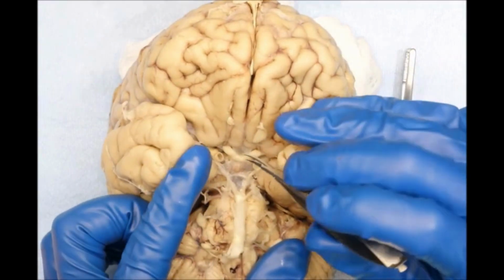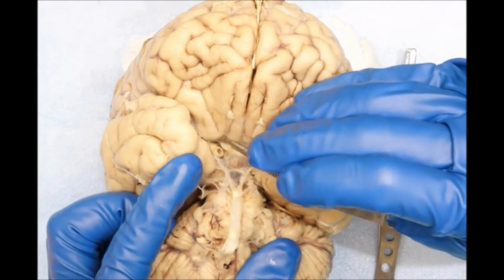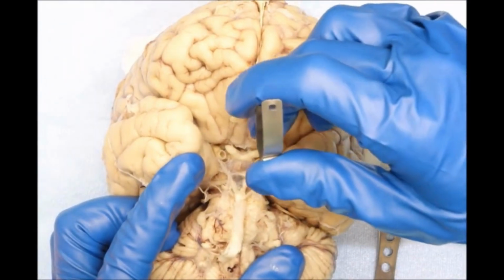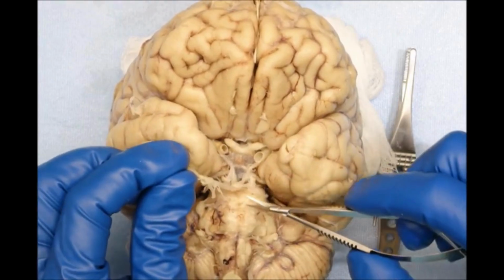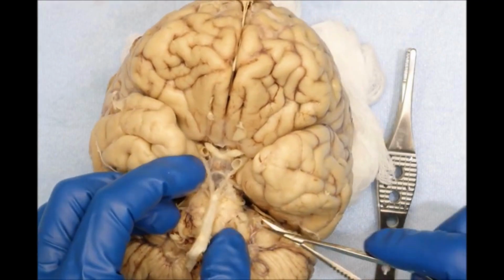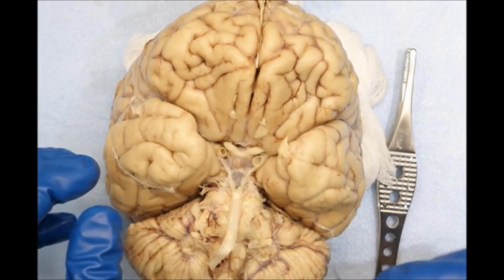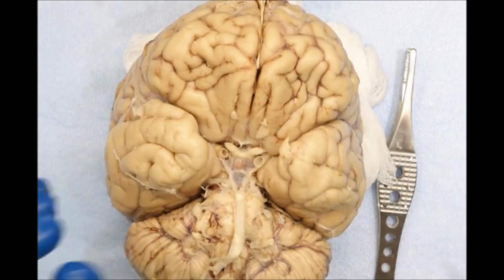I'm adjacent to the optic nerves right here, cutting through some more of the leptomeninges. There's the left internal carotid. There's a basilar. I'm holding on to the vertebral arteries. And I'm also cutting the thread-like branches deep to all these cerebral arteries in order to remove the circle of Willis.